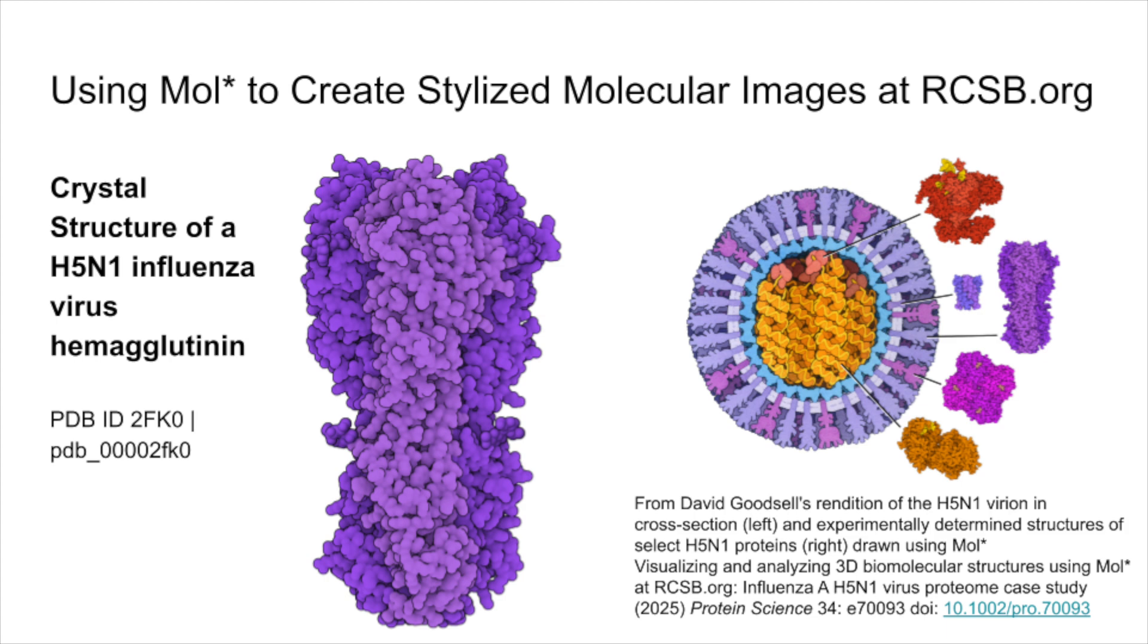We'll be working with an example structure from the H5N1 influenza virus, but these steps can be applied to any protein or molecular assembly. In this example, we're using PDB ID 2FK0, which corresponds to a protein from H5N1.